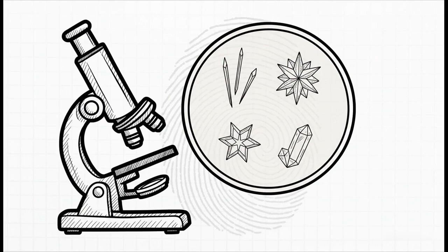When you heat reducing sugars with a chemical called phenylhydrazine, something amazing happens. They form these tiny, solid crystals. And the shape of those crystals under a microscope, it's like a fingerprint. It is absolutely unique for different sugars.